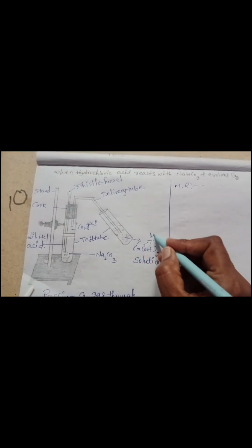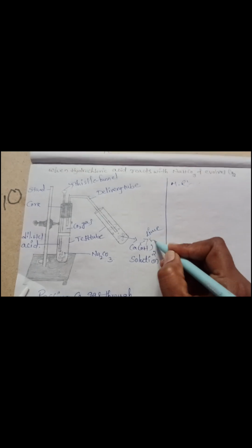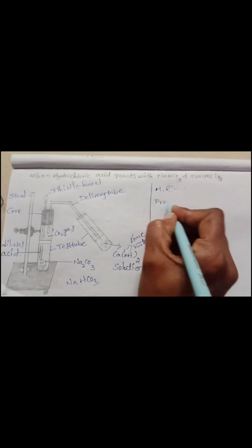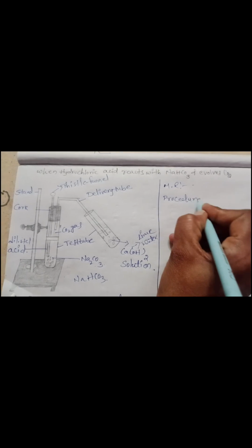Calcium hydroxide is also called lime water. Next, sodium hydrogen carbonate. So those are all the materials required. Let's move to the procedure.